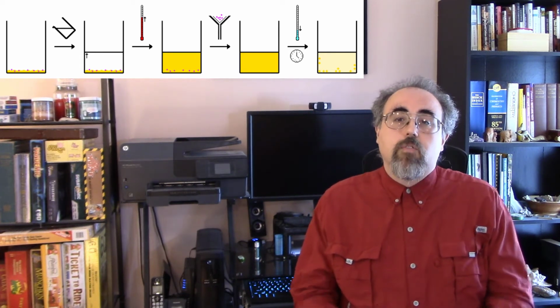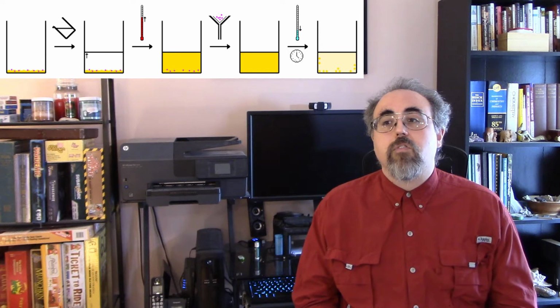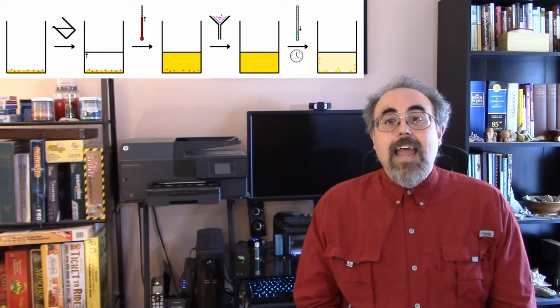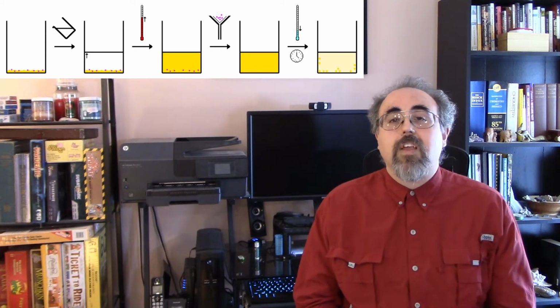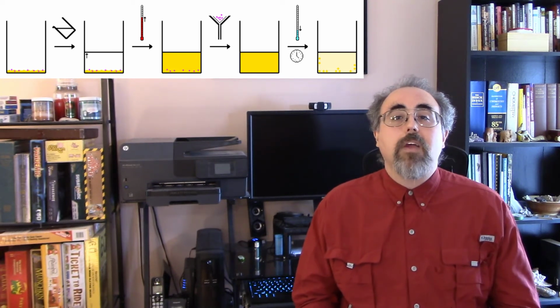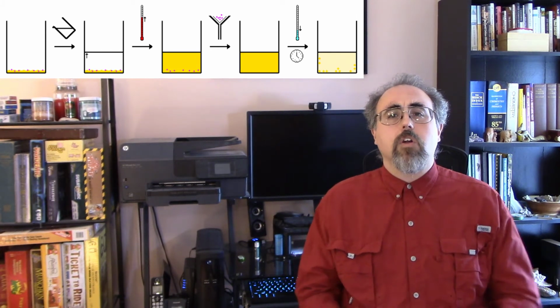So that now goes through a filter that keeps the solid material that didn't dissolve up in one part of your apparatus and allows the solvent and the material that it dissolved to travel through. Now, if you used a very conservative amount of solvent, but you used it fairly nice and toasty, then what's going to happen once it cools down, it will have become super saturated and it will start to take the chemical and that chemical will precipitate out, what we usually call recrystallizing.